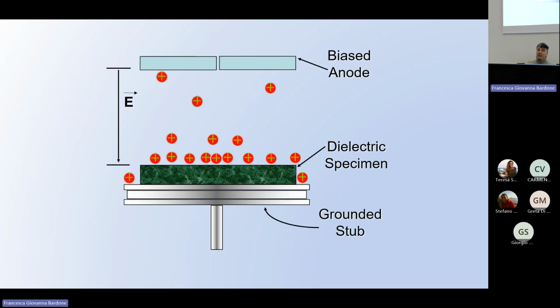The system automatically creates a zero charge surface, always working with this principle. So the secondary electron creates positive molecules, and at the same time amplifies the signal. The molecules, being positive, go to the surface which is negative, and the surface is no longer negative, and the molecules become neutral again as a function of time. All these mechanisms happen as a function of time. You always have neutral molecules because of this effect.